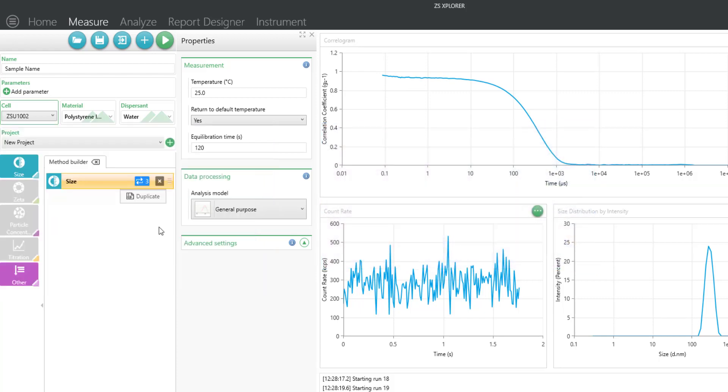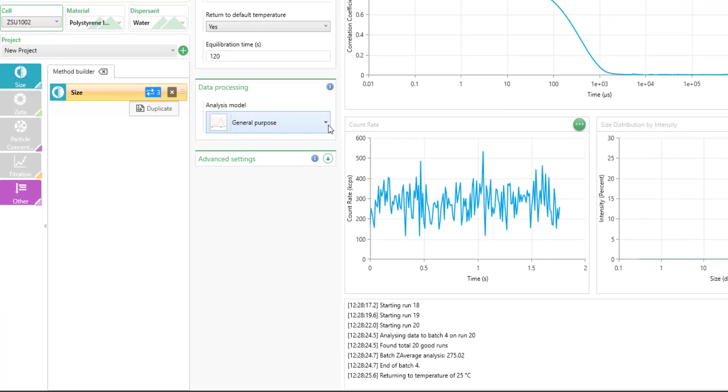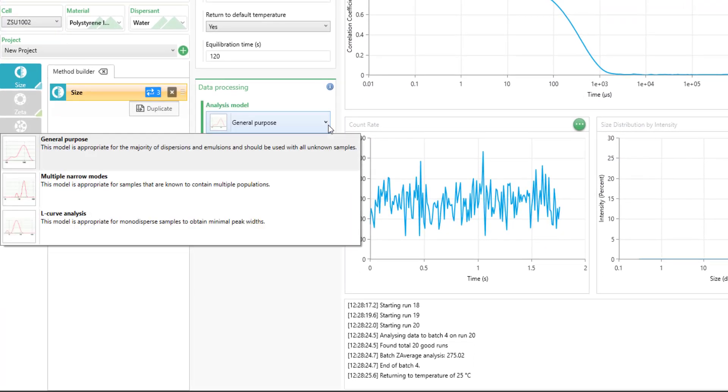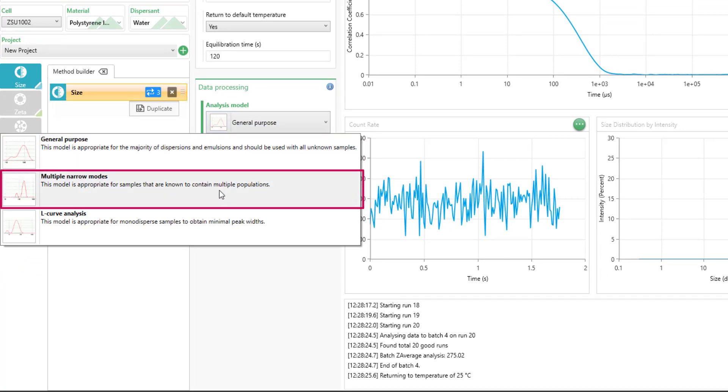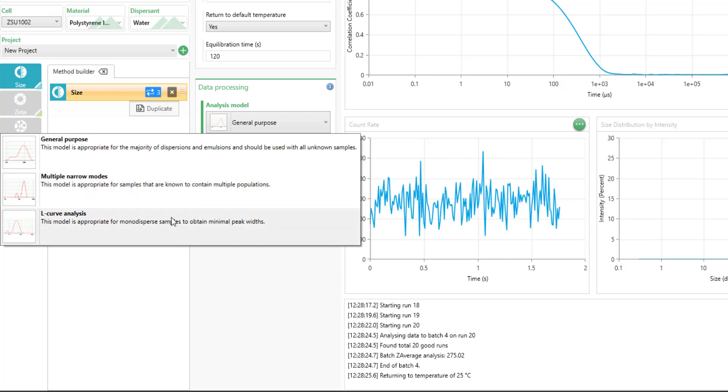Now let's look at some of the other processing and advanced features that you have as options for SOPs. For the analysis model, there are several here. You'll see the general purpose, multiple narrow modes, and L-curve analysis. This is from most conservative to more aggressive treatment of noise within your correlation data. It's advised to generally start with a general purpose model. This can also be edited later.